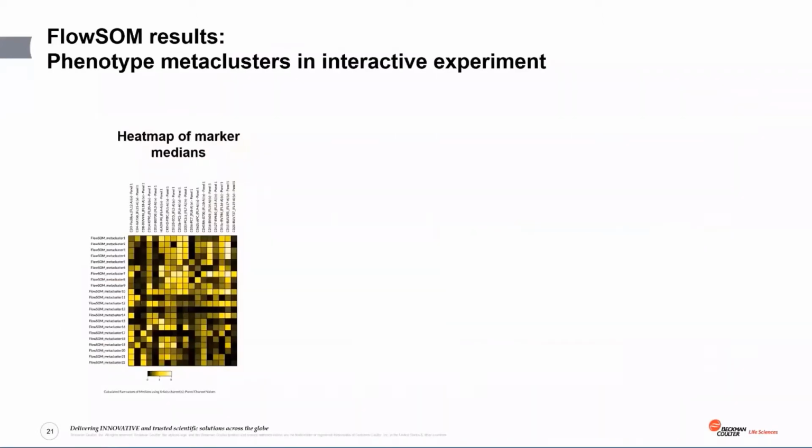So I chose to focus here on the result from the run with 22 metaclusters to walk through how to phenotype them. As you can see, with the highest number of metaclusters I ran, 22, it's a little more difficult to look for patterns with this large number of metaclusters, but each metacluster will be fairly pure.